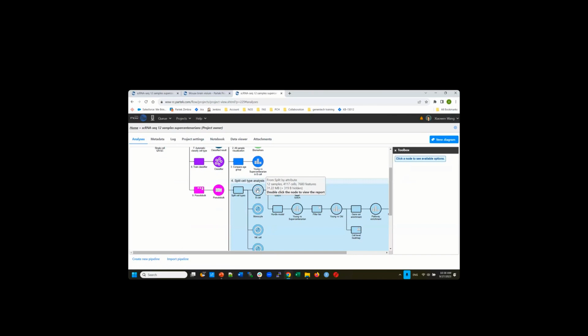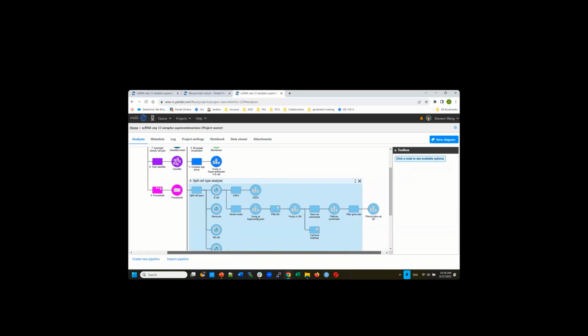I can perform a differential analysis, compare old versus young, and also I can perform pathway analysis, perform GSEA, or all the downstream analysis. And you can do it on different cell types. So once your cell type is classified, you can separate each cell type and compare your phenotype to look for genes showing differential expression.